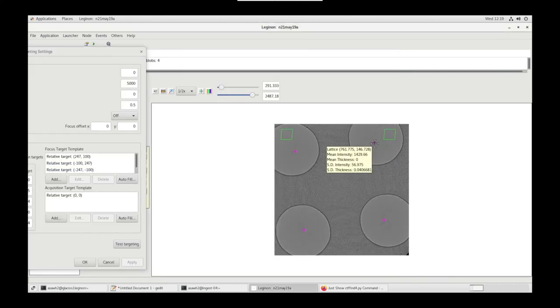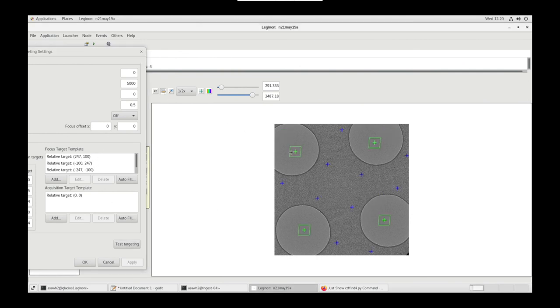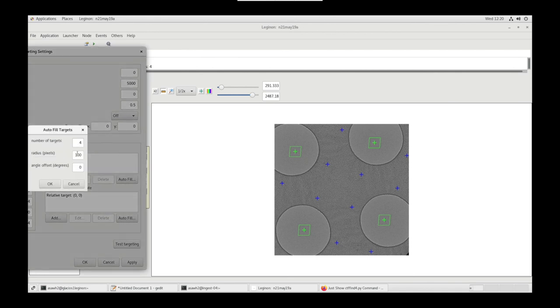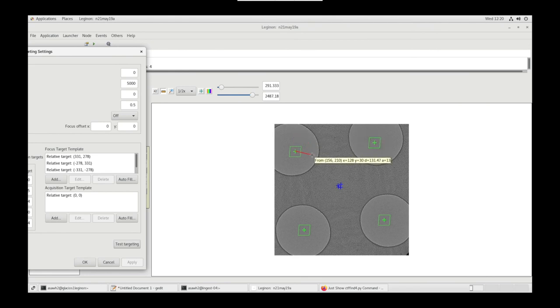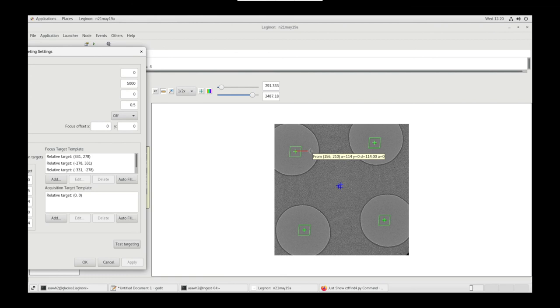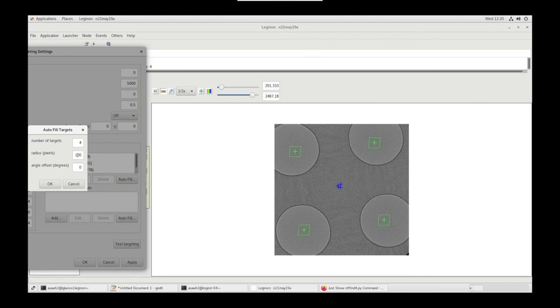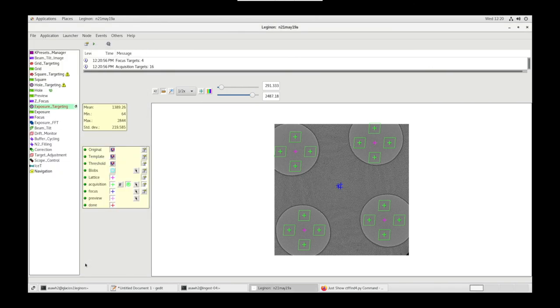Now let's hover over the lattice point. We can change our settings based off of that number. Let's use the Ruler tool and go from Acquisition Point to the center of the four holes. Delete the Focus Target template, Autofill, and insert those values. Okay, Test Targeting. Perfect. We want our focus in the center. Now if you wanted to change your Acquisition Targets and put them at different locations of the hole, you can measure that out and change your Acquisition Targets. There you go. Okay. Press Play.